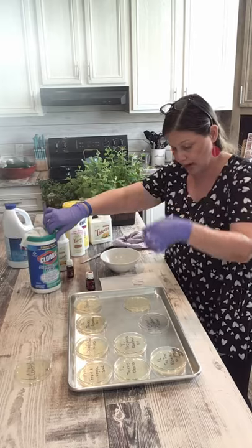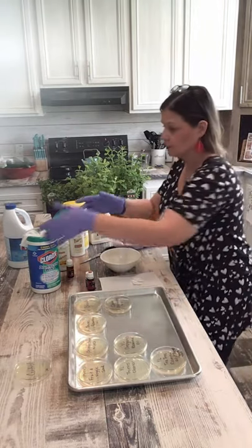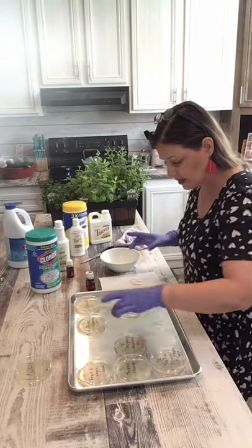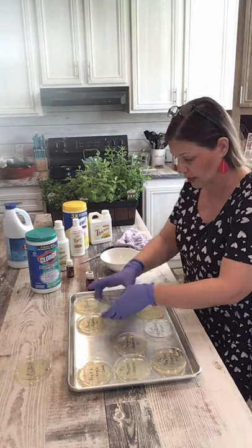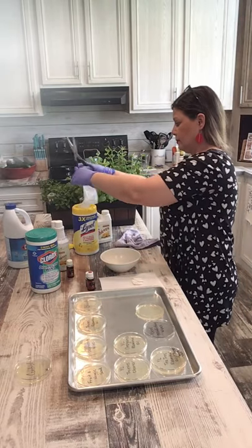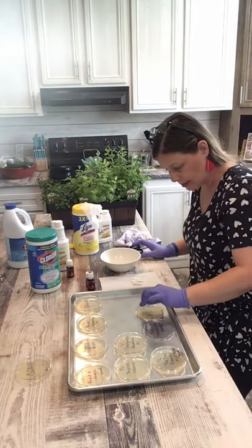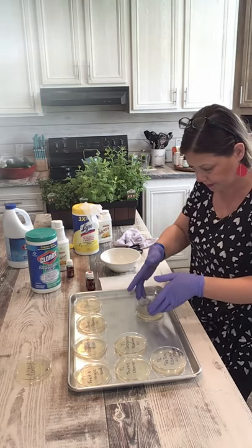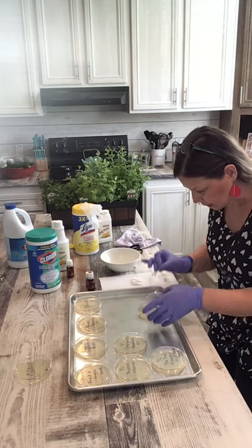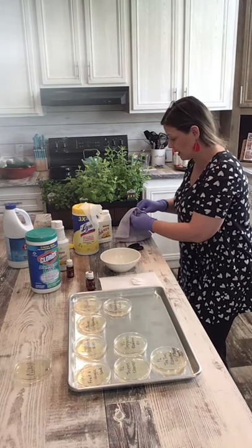Alright, Clorox disinfecting wipes going right in that petri dish with the lid. I did get that one all over my hand — thank god for gloves! Alright, I'll move on to the Lysol disinfecting wipe. Same with this — I will just cut a piece about the same size as the ones from the paper towels, put that in there, press it down a little bit. There we go. Alright, up next is the Young Living Oregano essential oil.